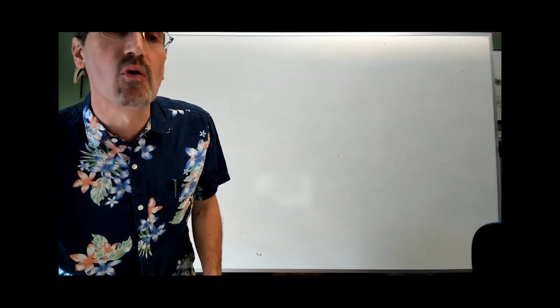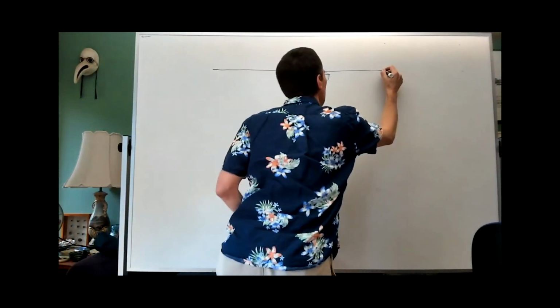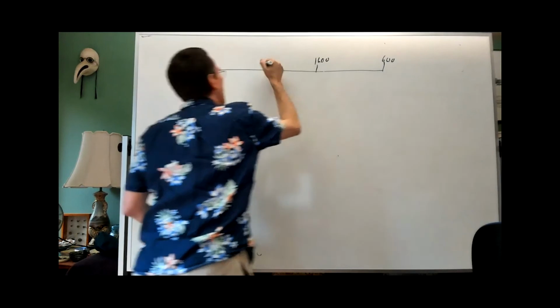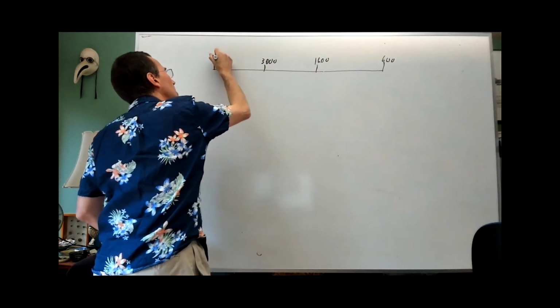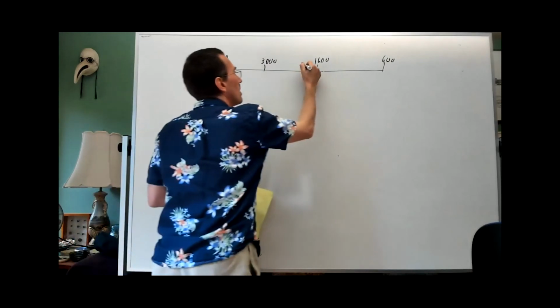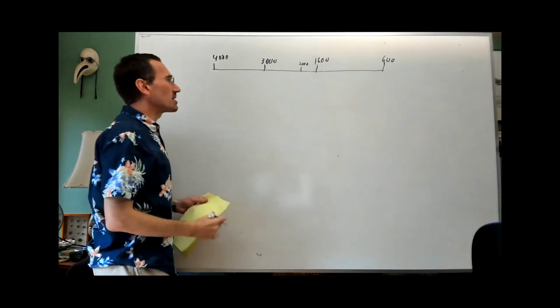And in fact, more than maybe will just exist in your usual working vocabulary. And I keep coming back to the idea that you really need to learn how to read an IR spectrum, that it's not just about memorizing band strengths and so forth. You certainly need a working knowledge. But as I was saying, you can spot a lot of interesting stuff.